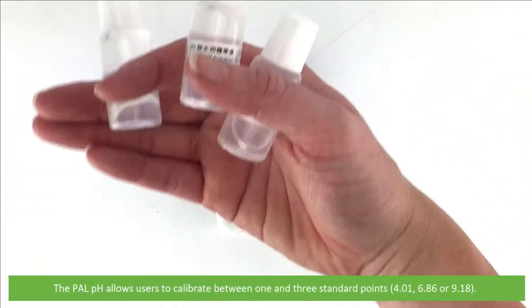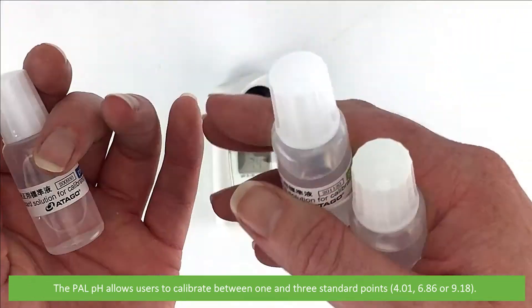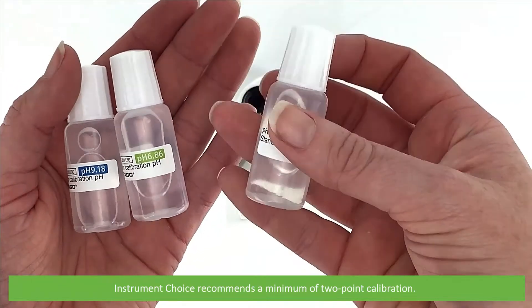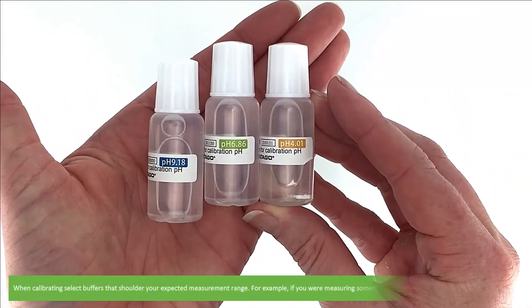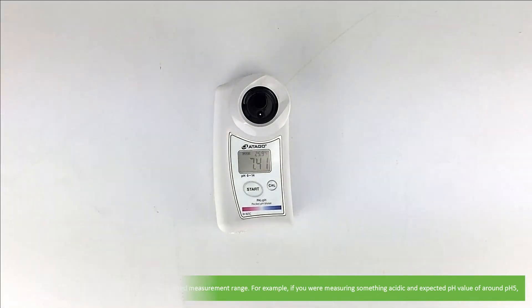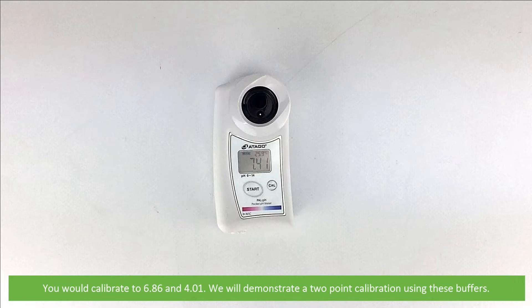The PAL pH allows users to calibrate between 1 and 3 standard points. Instrument Choice recommends a minimum of 2 point calibration. When calibrating, select buffers which shoulder your expected measurement range. For example, if you are measuring something acidic and expecting a reading around pH 5, you would calibrate to 6.86 and 4.01. We will demonstrate a 2 point calibration using these buffers.